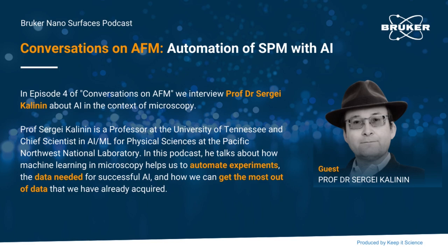So over time, my group started to work on automated microscopy more than 6 years ago. We came to realize that what we need to think about is the operations and decisions made by the human operator. What I mean by that is, think about the day of the microscopist. You take your sample, you put it in the microscope, and then you go through a set of operations, starting from tuning the instrument, finding the interesting region, potentially zooming in, zooming out, taking spectroscopic measurements.